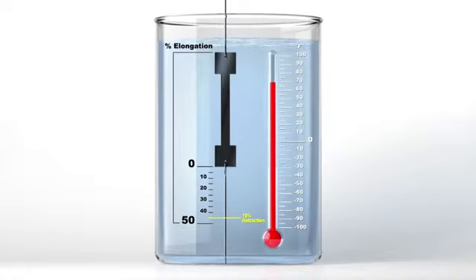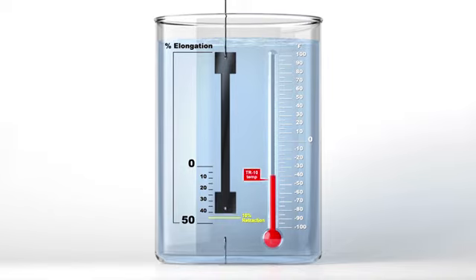In this method, the compound is clamped, then stretched 50% in a temperature-controlled chamber, and frozen to a temperature below what the material can recover from. At this point, one end of the specimen is unclamped, and because the temperature is colder than the material's flexibility, the specimen stays elongated. Gradually, the chamber temperature is increased, and when the material regains flexibility, it begins to retract. The temperature at which the specimen retracts 10% of its elongated length is defined as the TR10 temperature.